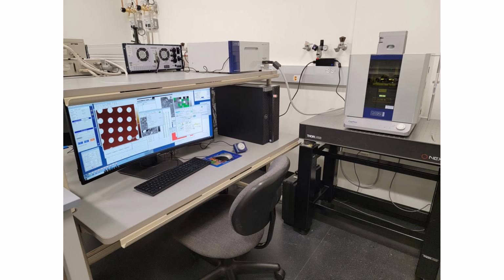Here's one of the newer instruments recently purchased with the new addition of the science building. So here is a Cypher Asylum AFM, and this has environmental control capability, and it has this acoustic isolation that allows you to take atomic resolution images very easily.